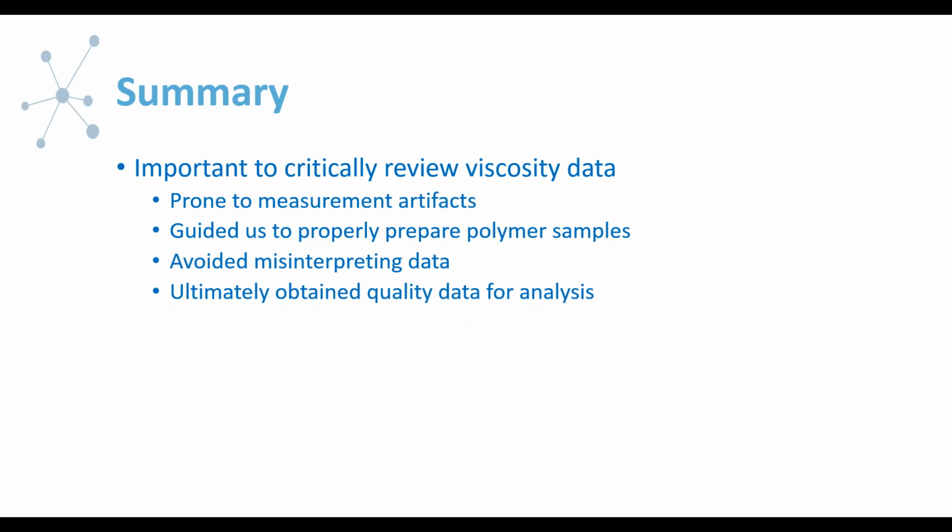And this avoided any data misinterpretation, which can happen, because it's quite interesting if you prepare a shear thickening fluid that's unique, right? But you want to avoid this misinterpretation. Once we reevaluated the situation, we were ultimately able to obtain quality data that we could analyze and get some useful parameters.